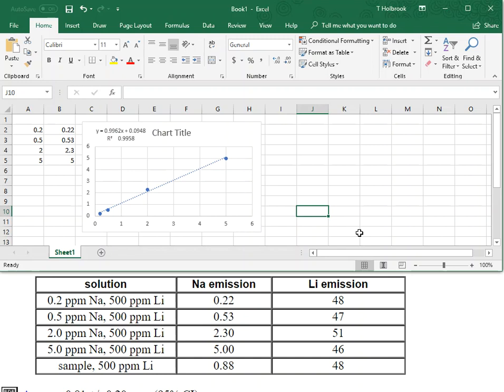It looks like standard number 3 is a little bit high. We would have originally looked at this and said, you probably added a little bit more than what you needed to in standard number 3. But overall you did a really good job, so we'll pat you on the back and away you go. But now you need to keep in mind that the instrumentation can cause you problems, right?